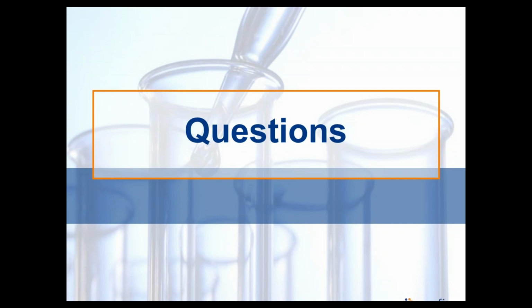Another question regarding FTIR analysis. How varied can a comparison sample be before declaring it to contain foreign materials? And this is our last question for the webinar.